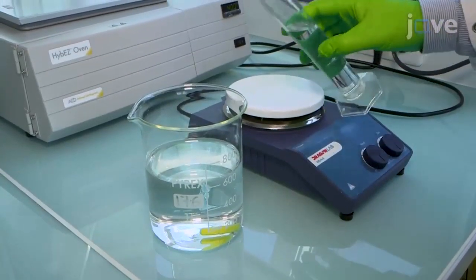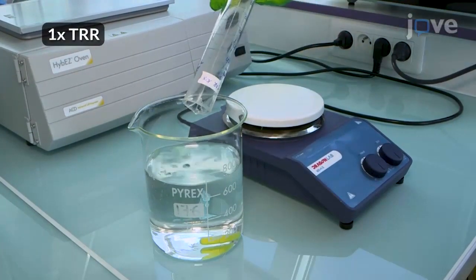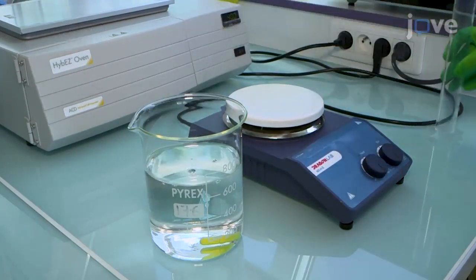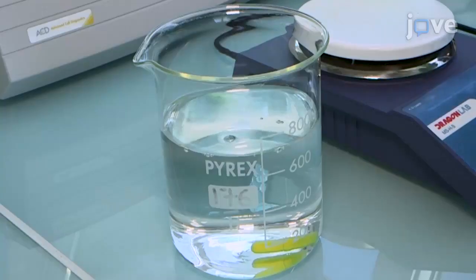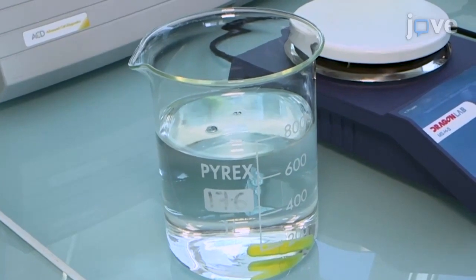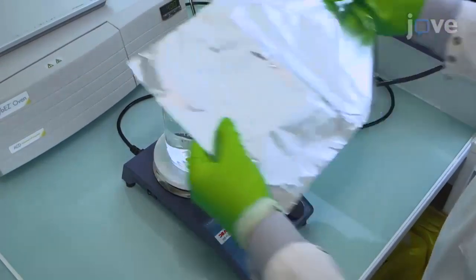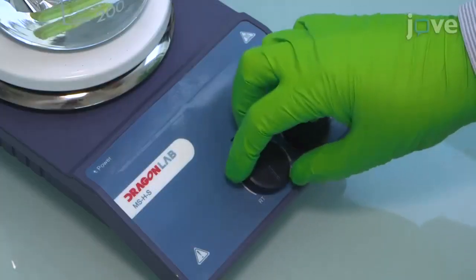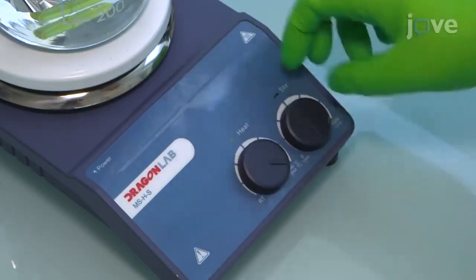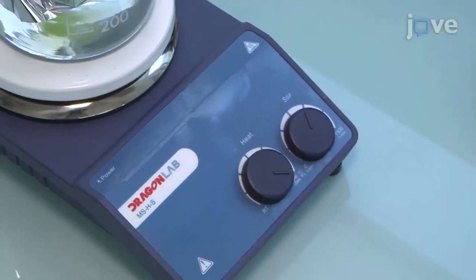After preparing buffers and counterstaining reagents, prepare 1x target retrieval reagent in a large beaker by adding 70 milliliters of 10x target retrieval reagent to 630 milliliters of distilled water. Place the beaker on a heating plate with a magnetic stirrer and cover it with aluminum foil. Boil its contents at 100 degrees Celsius for 10 to 15 minutes, making sure not to boil it for longer than 30 minutes.